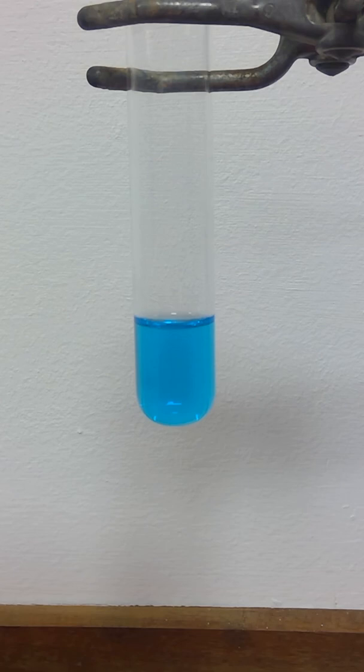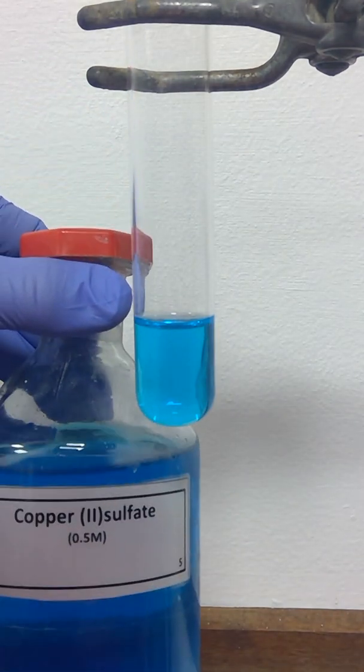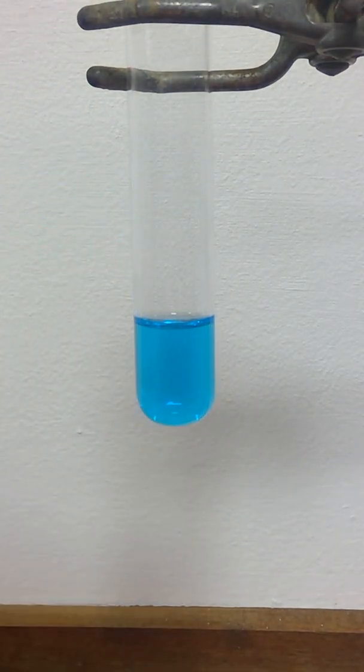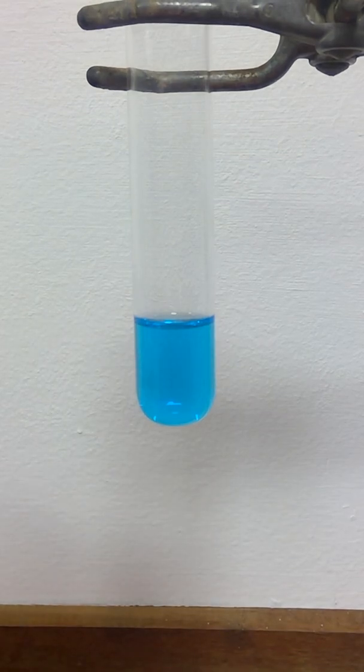In the first example, the first solution taken is the blue solution, copper sulfate. This solution has been made up by dissolving the blue solid, copper sulfate, in water. It is going to be mixed with sodium hydroxide solution. This has been made up by dissolving the white solid, sodium hydroxide, into water. It produces a colourless solution.